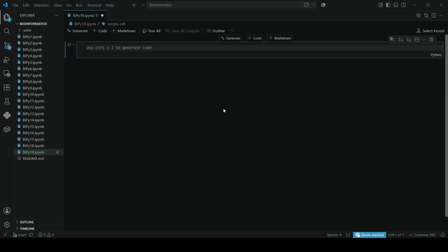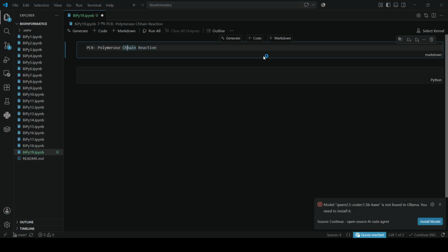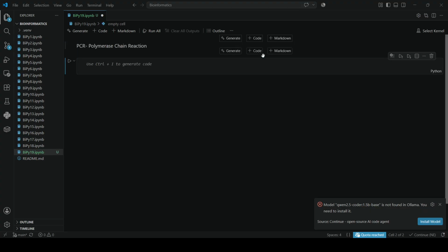Okay, so if you work in a biology lab, you probably do a lot of PCR to copy DNA, right? So to do PCR, you have to design short pieces of DNA called primers. In case some of you don't know, PCR stands for Polymerase Chain Reaction. Okay, so to do PCR, you have to design short pieces of DNA that we call primers, right?